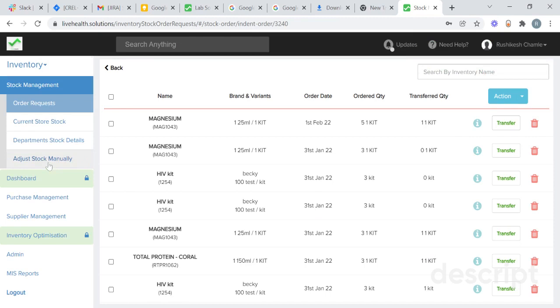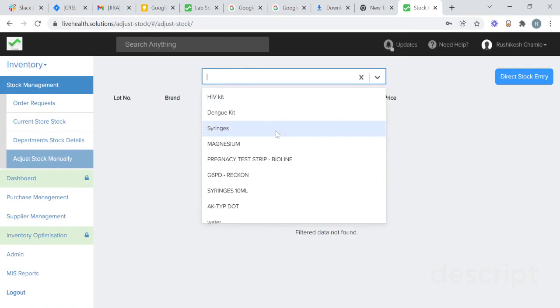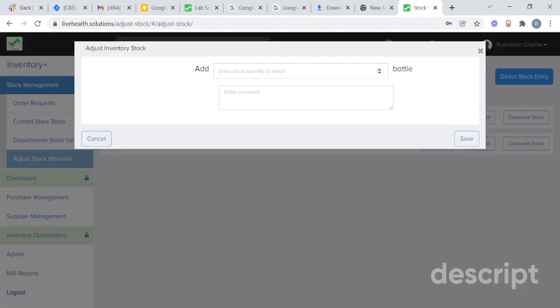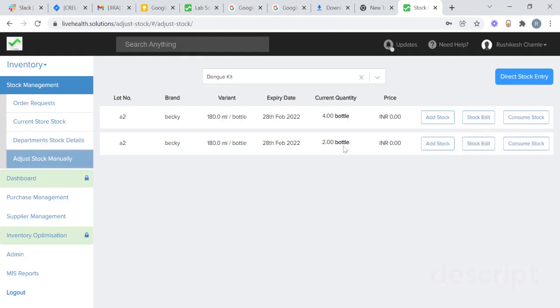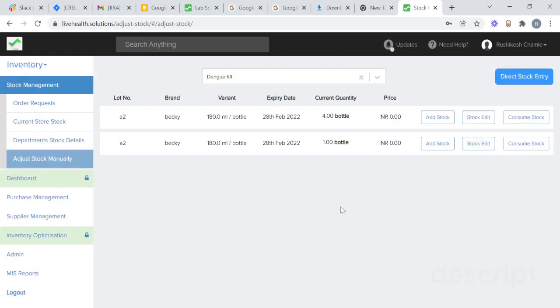At department level, from adjust stock, you will also be able to adjust the stock manually. Select the stock you want to adjust — suppose I want to adjust Dengue kit. Here you will get an option to add stock. Click on add stock, add the quantity and fill in the comment. Two products will be added to this slot. You will also be able to consume the stock from consume stock. Click on consume stock, add the quantity you want to consume — suppose I want to consume one bottle — add a comment, such as that we have spilled over this stock. We have consumed one bottle.